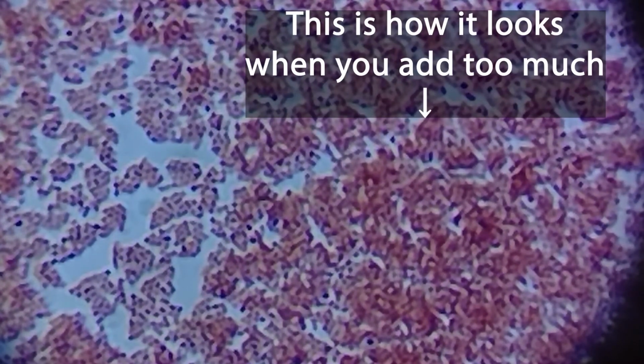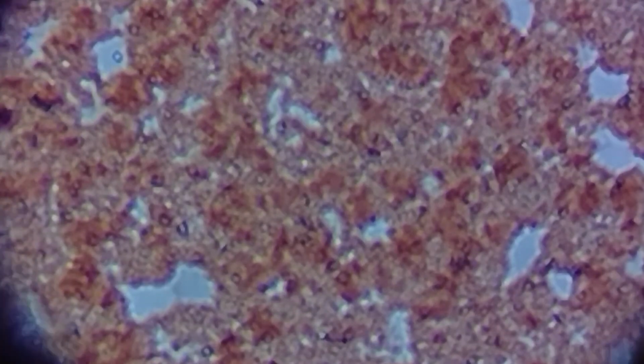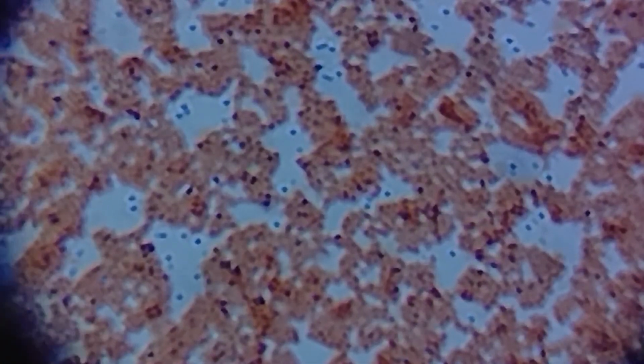So now we'll look at unknown 9. So this is unknown 9 under the 100x. And this one also looks like there's multiple layers. Well, this looks like a better part of the slide.